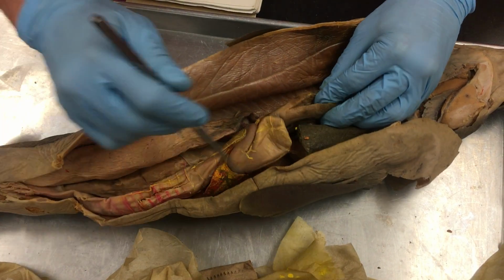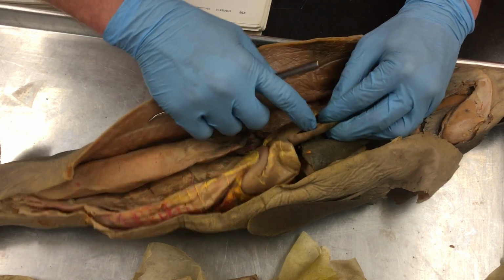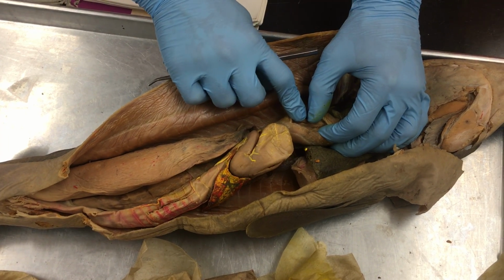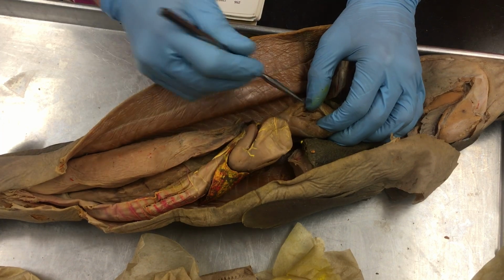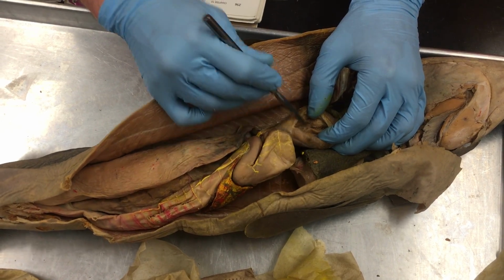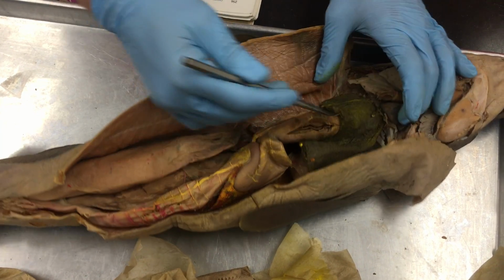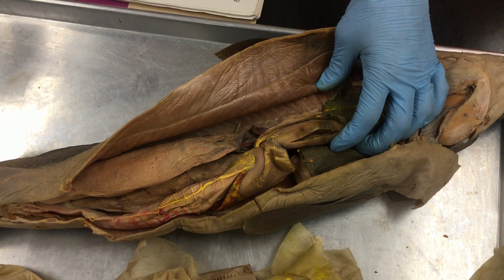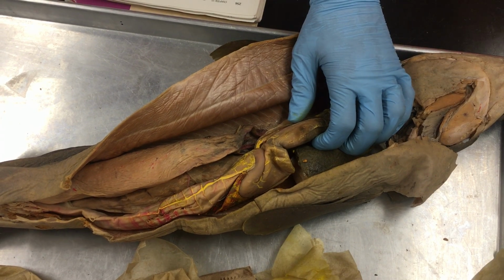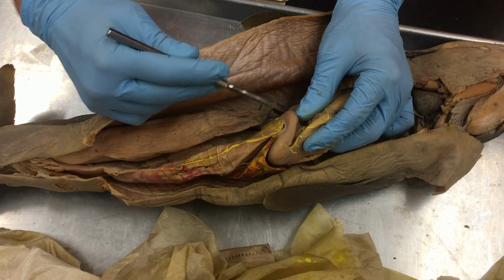So this is all part of the stomach here. So inside the stomach, you've got the rugae. These flaps in here just increase surface area. And then regions of the stomach, cardiac is closer to the heart. Gastric is the main portion of the stomach. And then the pyloric region is where this curve happens.